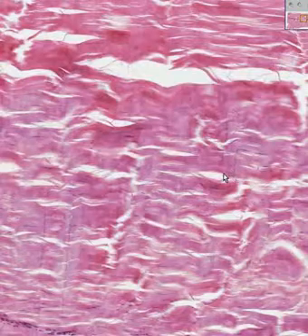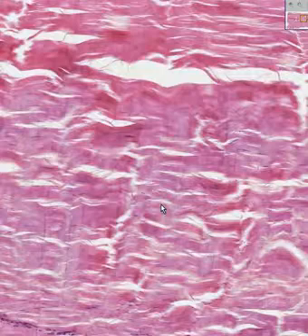And also, in difference to loose areolar connective tissue, you're not very likely to see other types of round free cells in here like we did with the areolar connective tissue. In the areolar connective tissue, we saw, if you remember, lymphocytes, the most common type of cell, macrophages, the second most common type of cell. We saw a couple of plasmacytes. There could be eosinophils. There could be any other types of cells that you see in blood. But in this one, we see very little other than the fibroblasts and collagen bundles.